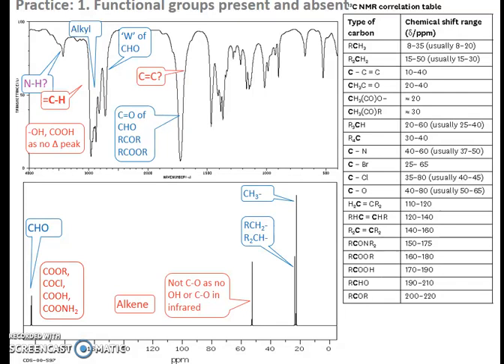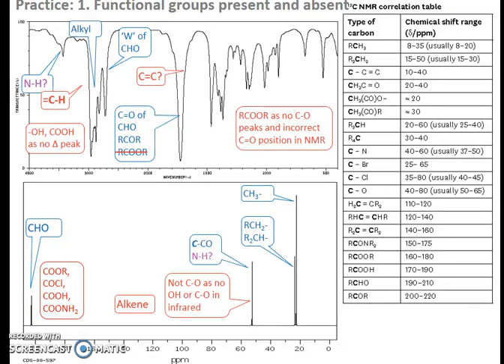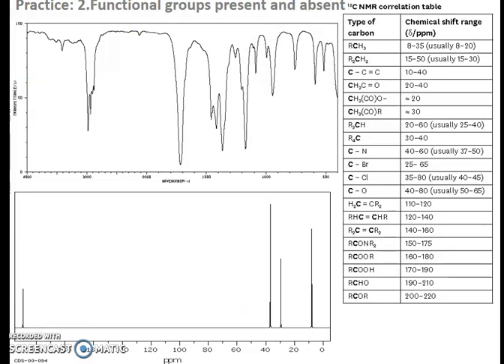It's either four carbons long or it's got five carbons with a branch at the end. And in fact, we know that it's not an ester, it's not an amide or an amine. It is, in fact, an aldehyde. And you can see the structure down there. So that's one example. Let's have a look at another one.